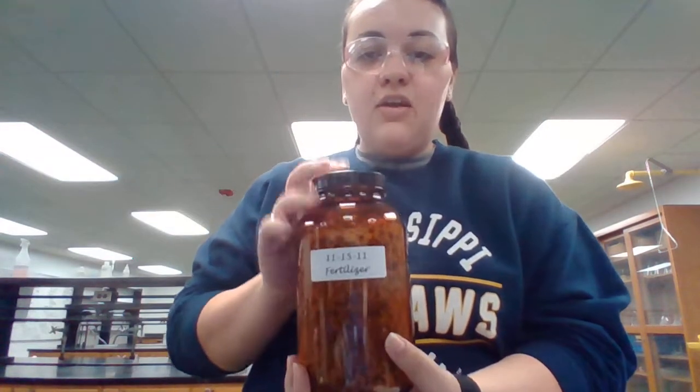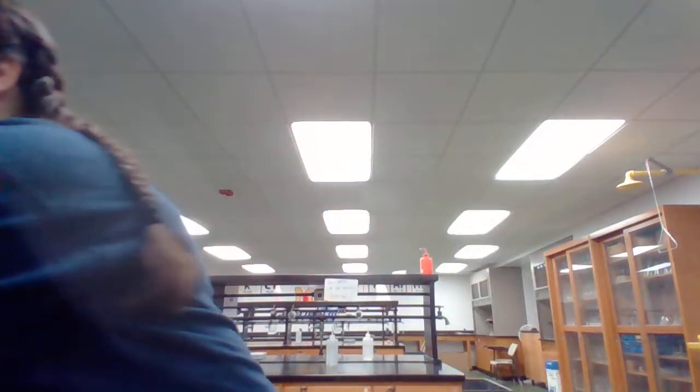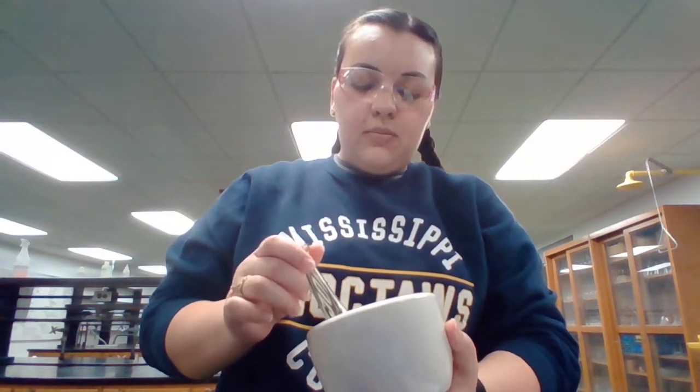We will have 2 samples that you could potentially use, so you'll either have 11-15-11 or 13-13-13, okay? So that will be what it looks like. It tells you that you can crush your sample with a mortar and pestle, put it on a weigh boat, weigh it, and record your exact mass on your data sheet. So this is a mortar and pestle. A lot of you probably already knew what this is and what it looked like.